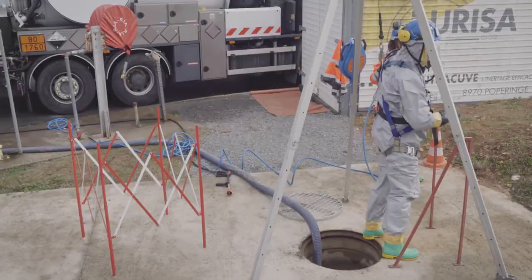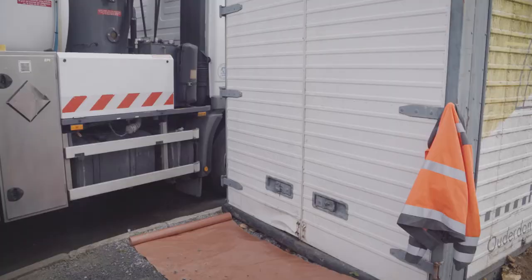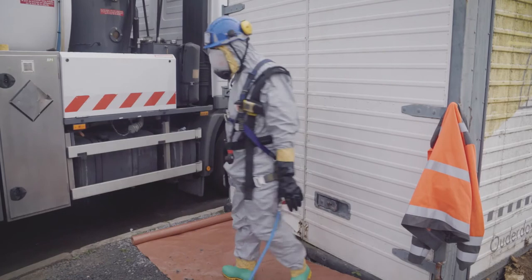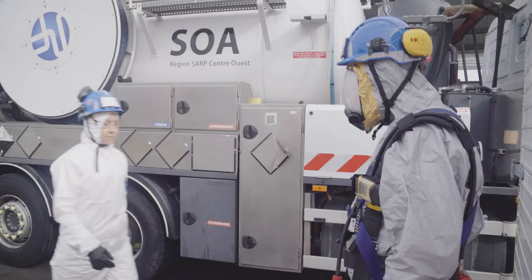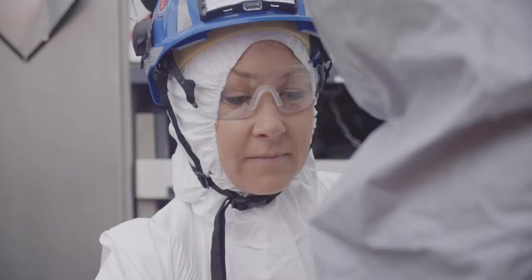After your operation, follow the decontamination procedure and rinse yourself down with water. Go to the garment doffing area to correctly remove the PPE and avoid any risk of contamination. Your colleague who wears the appropriate PPE will help you with doffing.